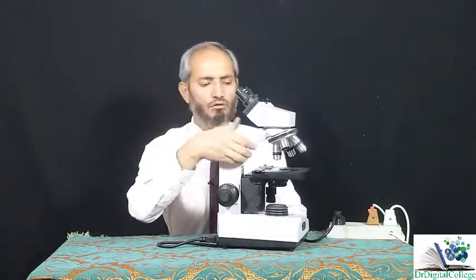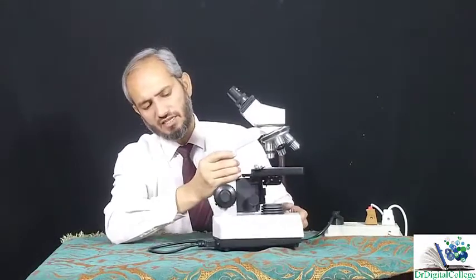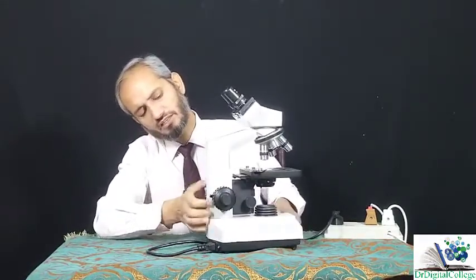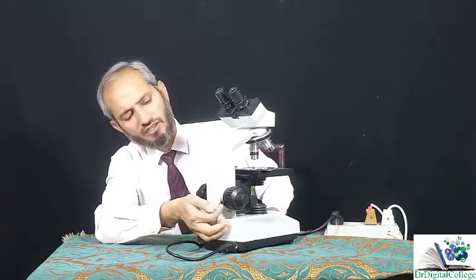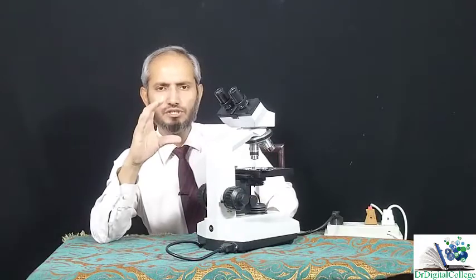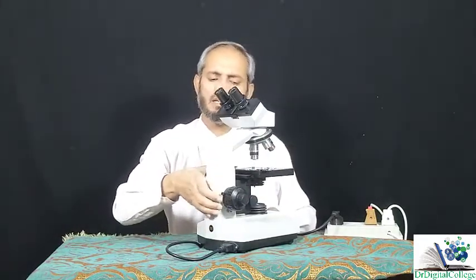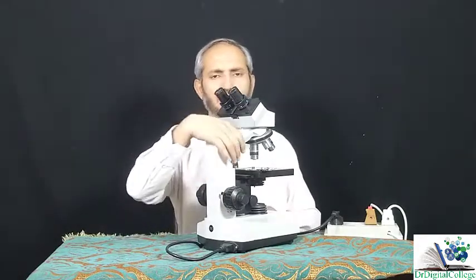Okay. Now, once you have focused your object, there is a lock over here. This is called the lock. Look at this. Once you have focused your object, you will lock your stage. This means that if you move it tightly upward like this, now your stage is locked.